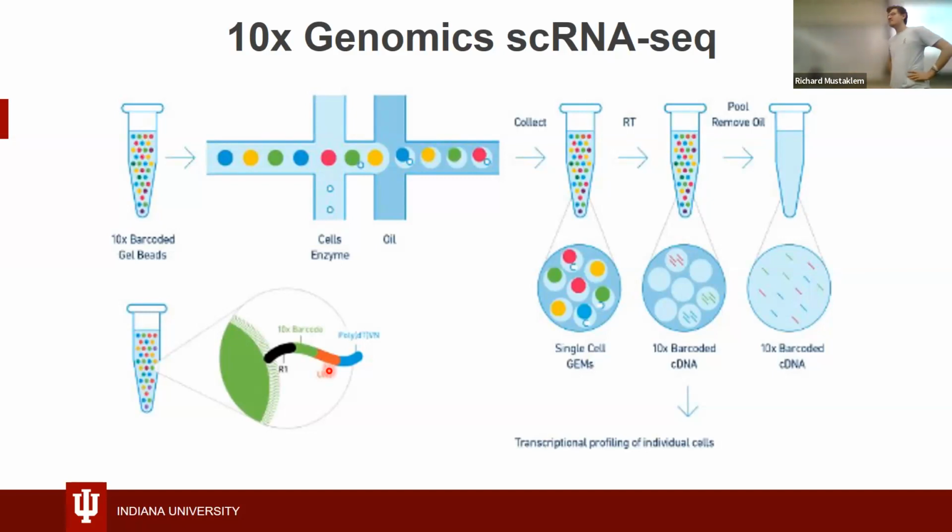What if there are 2 different types of cells? So you're saying they might have the same UMI or same 10x barcode? It's not impossible, because nothing is impossible in biology, but those are called doublets. When something is doubled, you have to use a function, which we're going to get into later, that separates out all the doublets and removes them from your data.